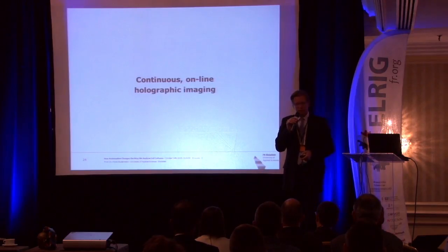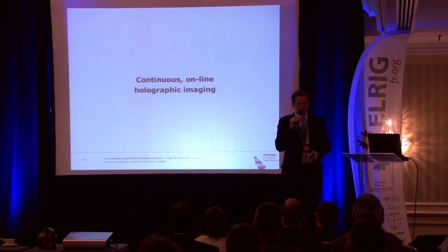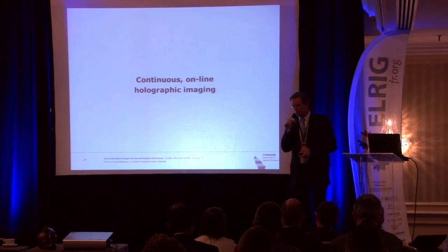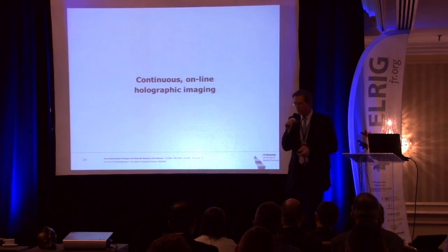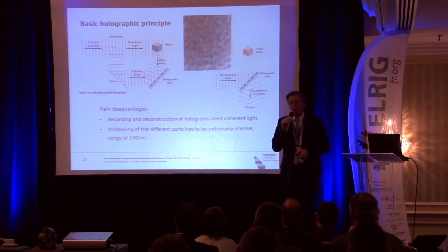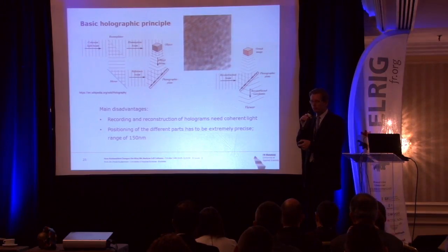Another example is a new method, which some of you may not know, that this technology is just entering the market. I saw the first two devices at the ESACT meeting in, I guess it is late May, in Spain. And we have one of those systems in our lab. It uses holography to monitor cells. And that's very, very interesting, because you can create a hologram in principle very easily.